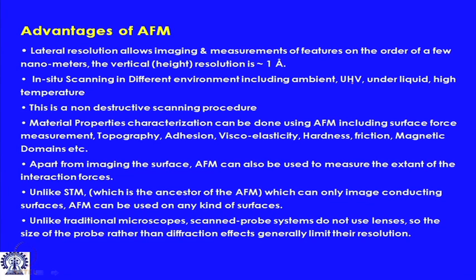And then, unlike STM, which we talked about very briefly, you remember that STM requires a sharp conducting tip and a conducting sample to work. The AFM does not have any such limitations, and it works equally well for a conducting as well as a non-conducting sample or any type of sample. So, polymer, ceramic, gel, liquids, everything can be investigated with an atomic force microscope.